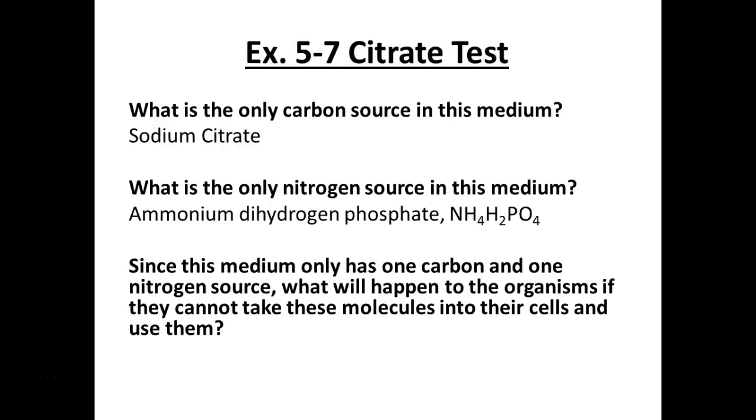What you're seeing might be the fact that you put a lot of bacteria on that slant to begin with. It's what we call a heavy inoculum. At this point, if it is not the same bright blue as that positive control on your lab bench, it is negative for citrate permease. And it is, in fact, dead.